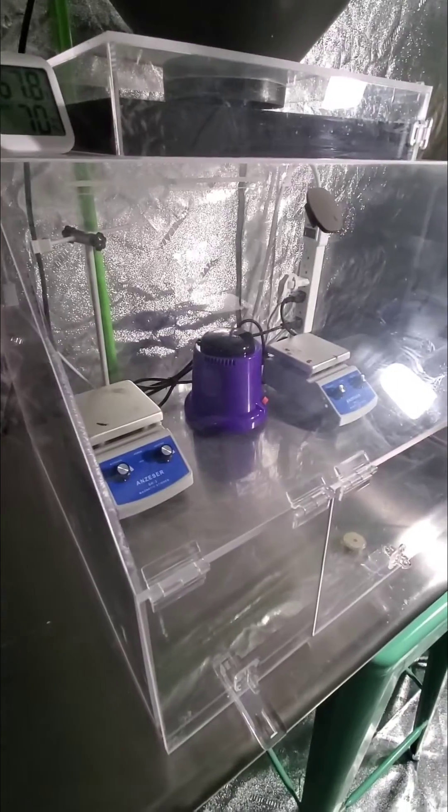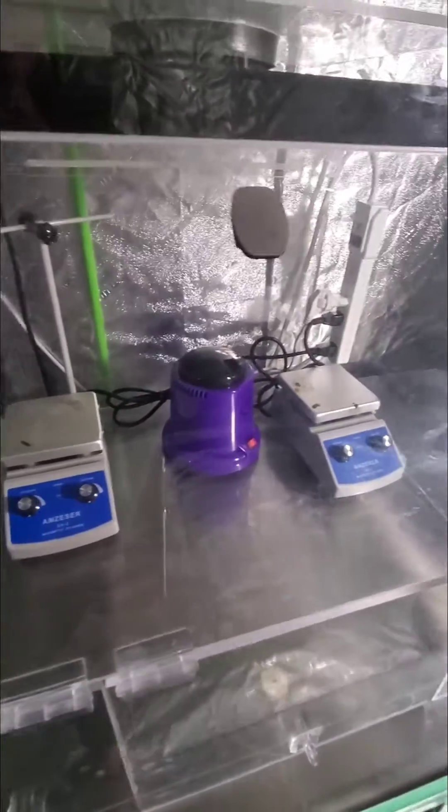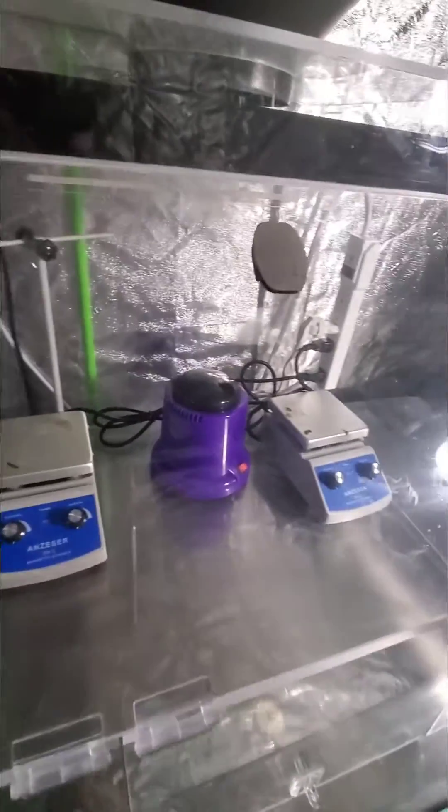It provides clean air inside my sterile box, in which you see two heating stir plates and a little glass bead sterilizer. This is where I do all of my tissue culture sterile work.